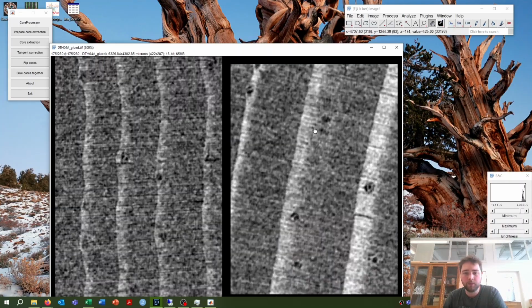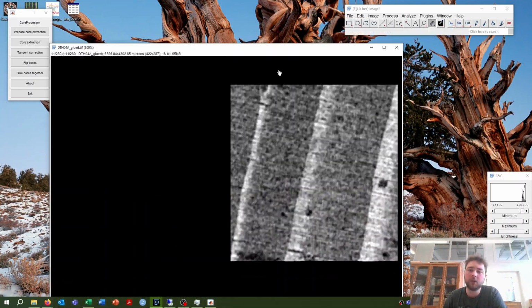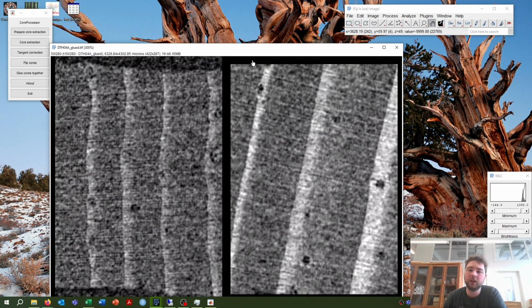And the areas around the crop which are not needed, these are minus 9,999, which is our not available number, so not a number value. These pixels will, when you load them into RingIndicator, be ignored and will never be taken into account in density calculation. So you can always use this value as a kind of empty space in your scans.